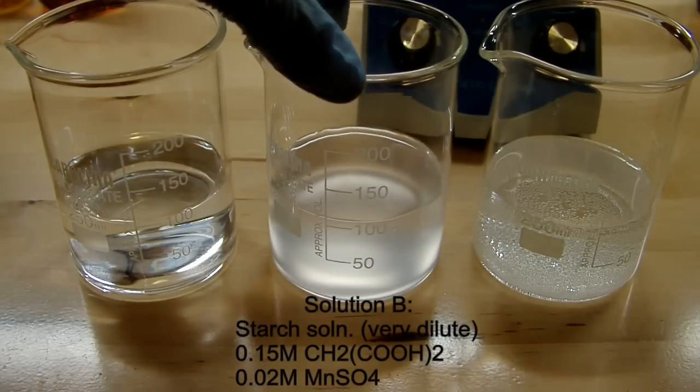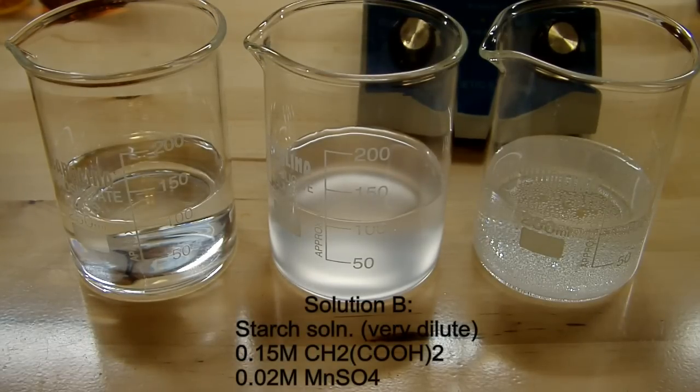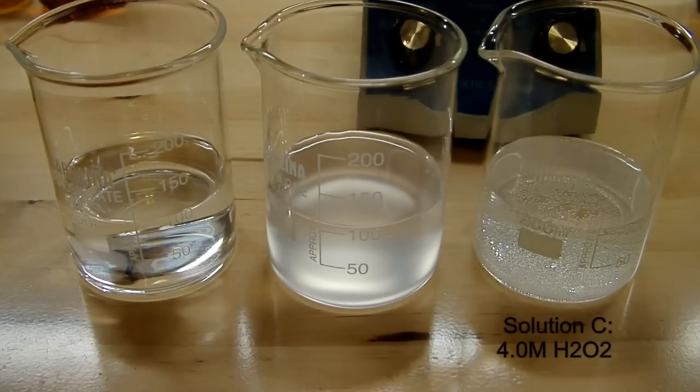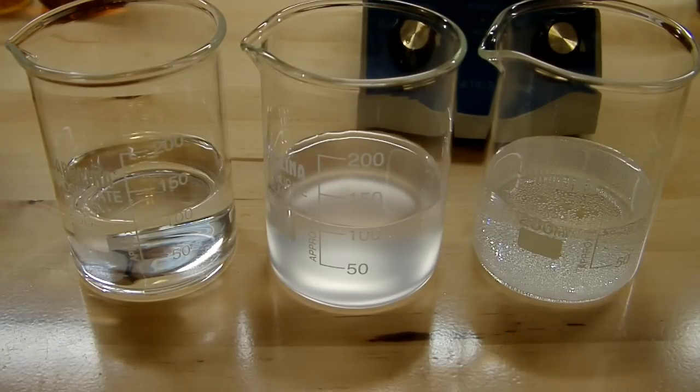Solution B is a starch solution that's 0.15 molar in malonic acid and 0.02 molar in manganese sulfate, and solution C is hydrogen peroxide, 4.0 molar hydrogen peroxide. I diluted down some 35% peroxide that I had to get this concentration.